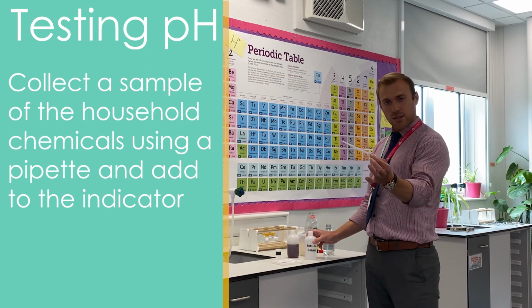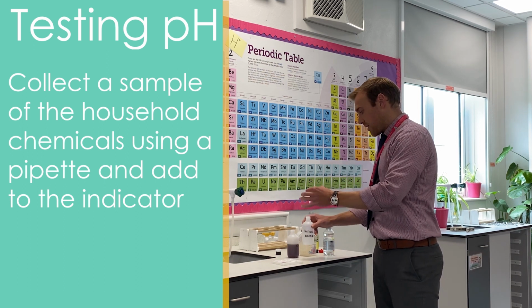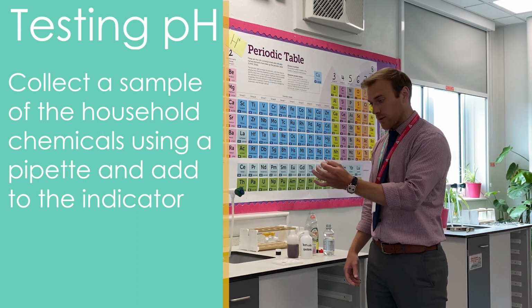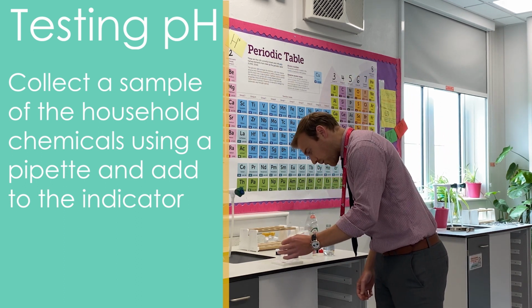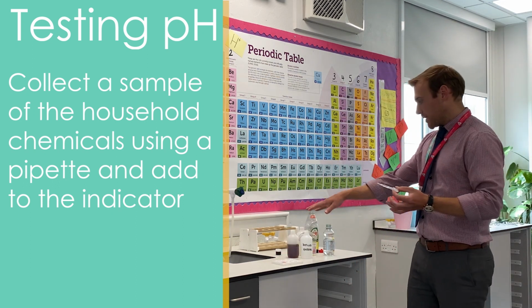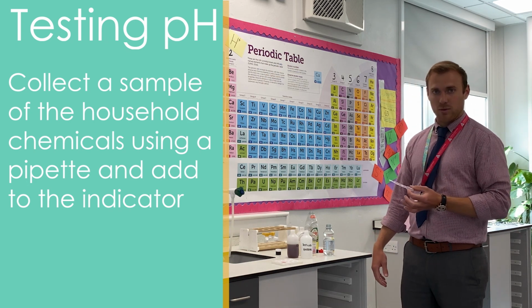So simply squeeze the top of the pipette, place it into the vinegar, and then you just need to squeeze a few drops. Don't go over the top, just a few drops into your indicator. And then you'd simply repeat that for the other 5 household chemicals.